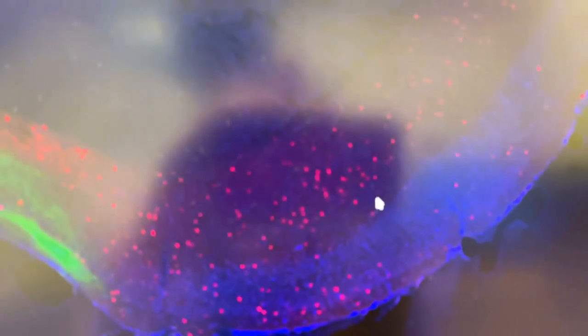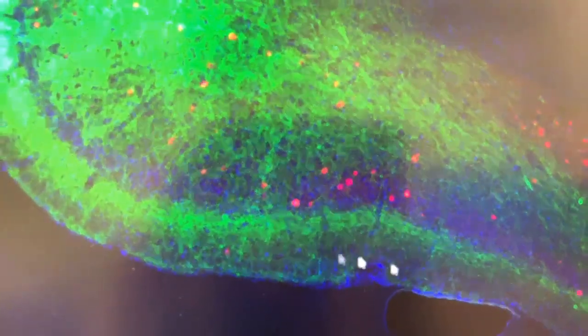Right here, it's cells. That's the paint can fill tool in Microsoft Paint. Those are the dot cells. So the red dots are cells, and the green is the virus.